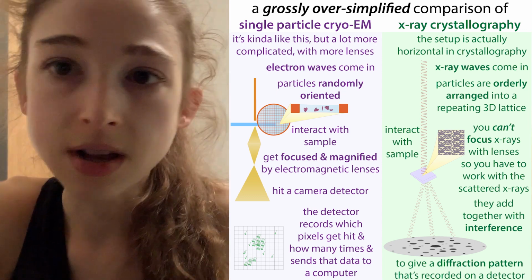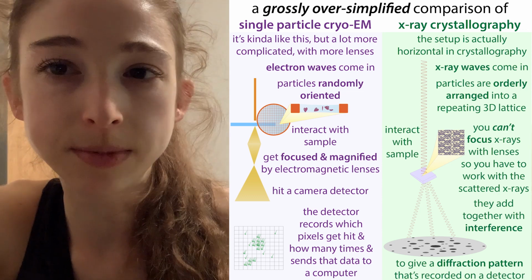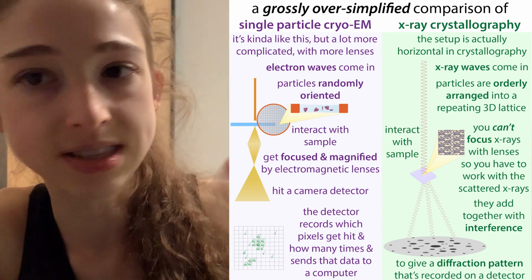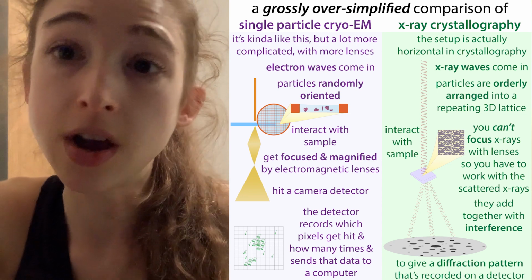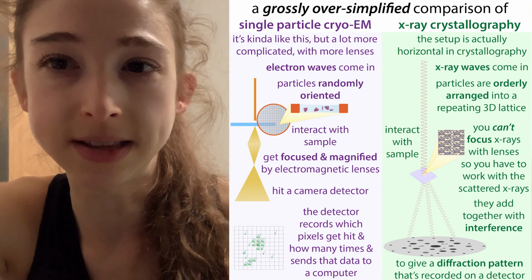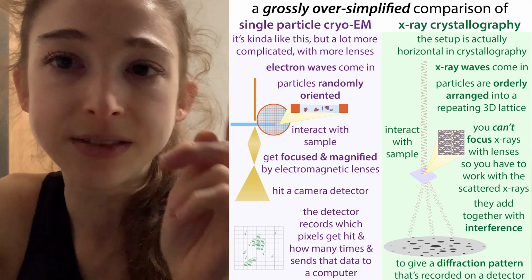With cryo-EM, there's also optimization of the protein and of the sample prep, lots of biochemistry that goes into this sort of thing. It's not just drop it on a grid and go. But yeah, really cool stuff. And cryo-EM is often used a lot with membrane complexes and things. You often do nanodiscs, where there's a little lipid around the protein.